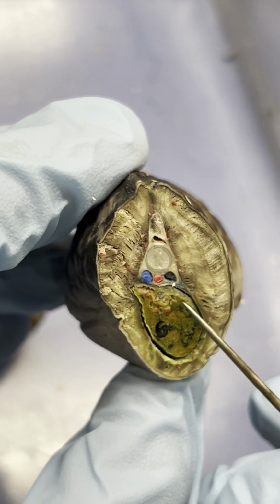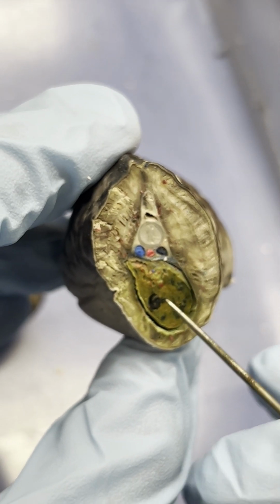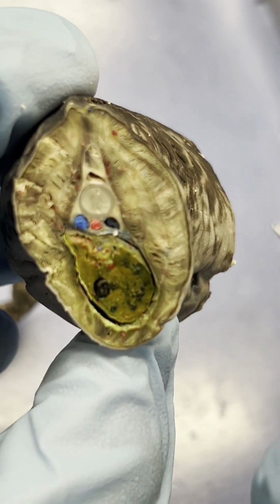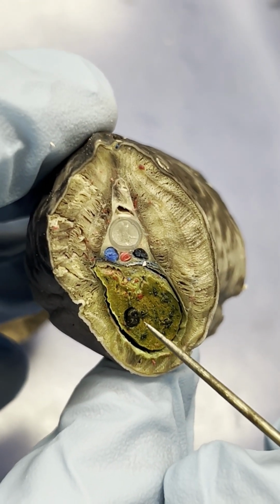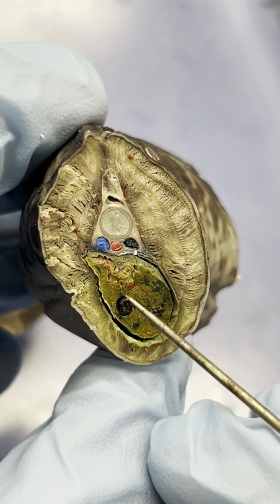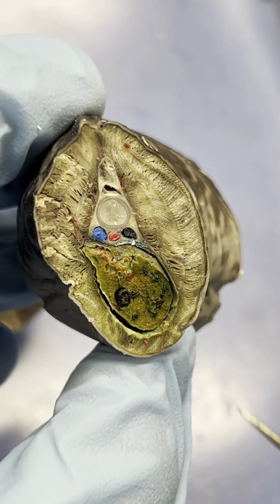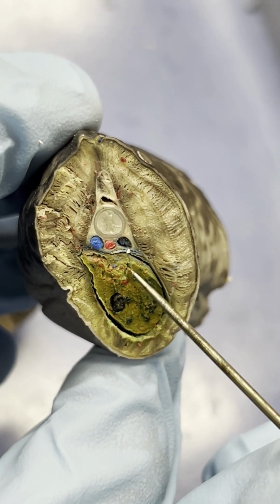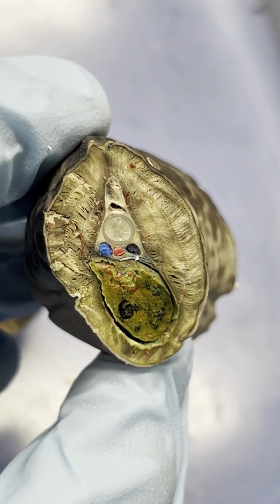We also have all this green area here, which is our liver. And this black structure right here is our intestine. So remember, one intestine. We're getting the focus again. I will stop moving to let Dr. Mick focus. Right here is our intestine, right here is our liver. But also in figure 3.6C, you should be able to find the gonads. In our cross-section, our gonads are hidden by the liver, but see if you can find your gonads as well, okay?